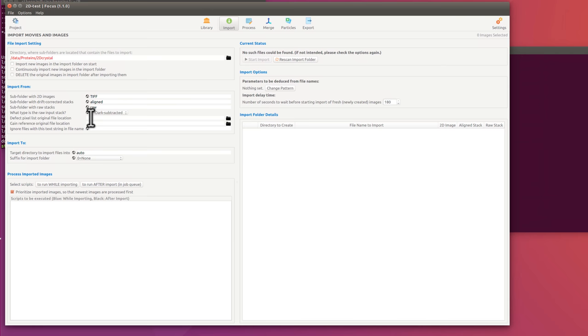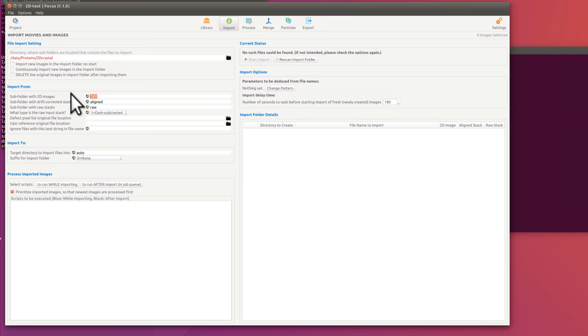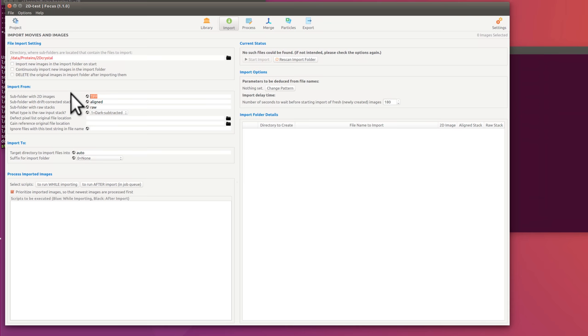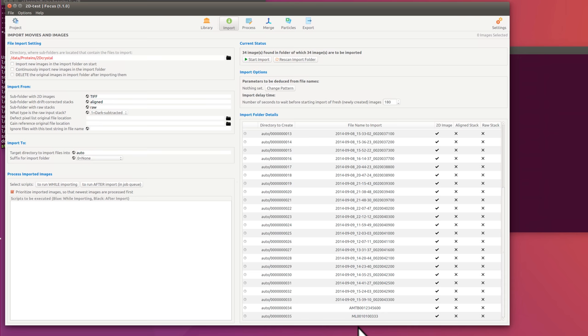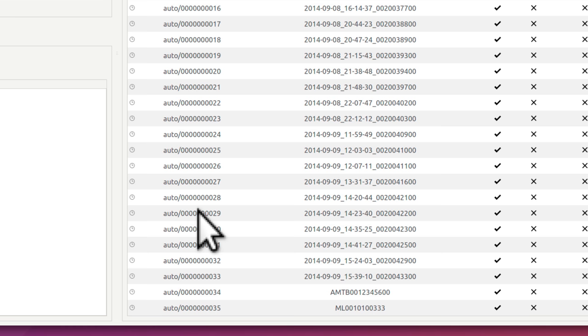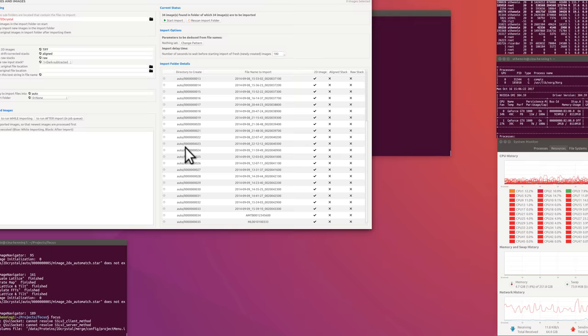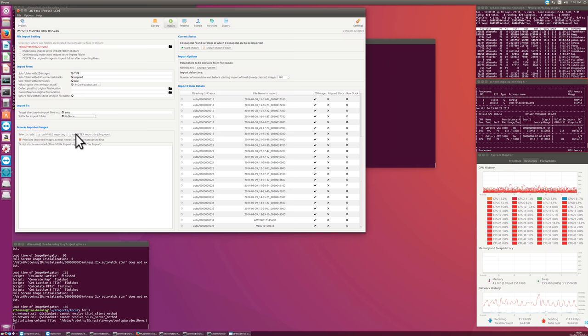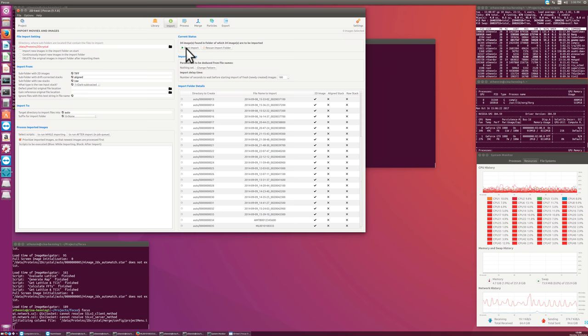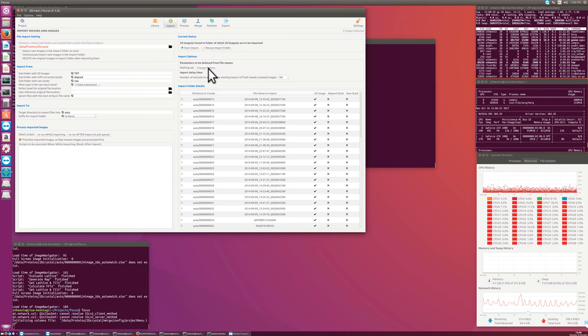And these are 2D images that were in the subfolder TIFF. And these are already gain corrected. So we do not need any of this here. This only applies for movies, dark subtracted or gain corrected movies. So we don't need this now. Right now, we are just dealing only with TIFF files. And if I rescan this folder, Focus finds all kinds of 2D images. But there are no aligned stacks or raw stacks. These are the file names that 2DX or Focus found. This is the 2DX scripts running here. And these are the folder locations that these will be imported into. They will all go into auto and then folder with a number.